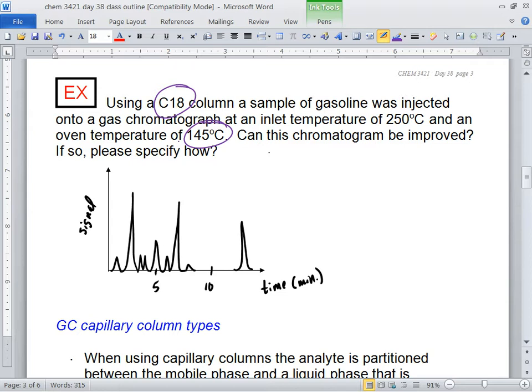What the question is really getting at is, how do you make these peaks move around? And remember, the power of chromatography is whatever this guy is, that's a property of that compound. He is always going to come off at that time as long as you don't change the parameters of the separation. That compound will always come off at that time. Or this compound or that compound. How do you move these guys around? You change the what?